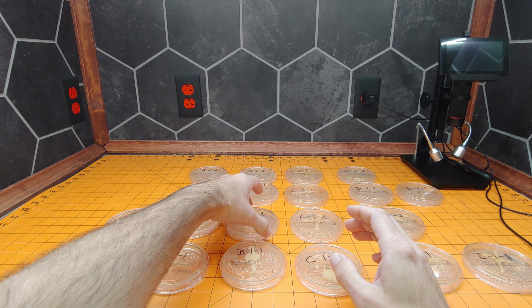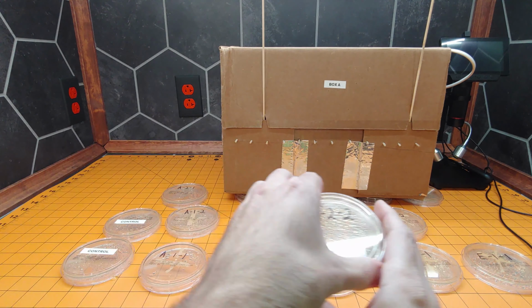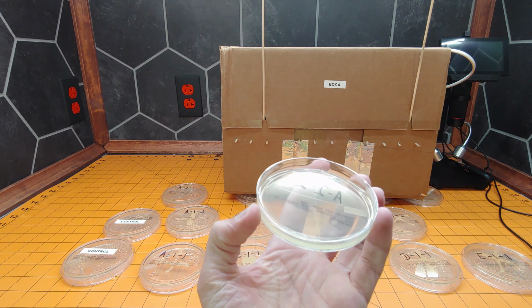Now let's take a closer look at each of the individual sterilizing methods. So group A was the DIY sterilizer box. So box A, post-sterilization of the key. You can see the marks we made with the swab, but nothing grew. So 1 minute in the sterilizer was enough to completely sterilize the surface of the key.